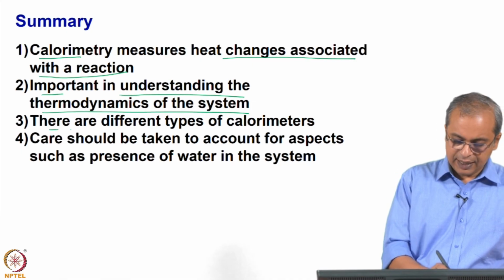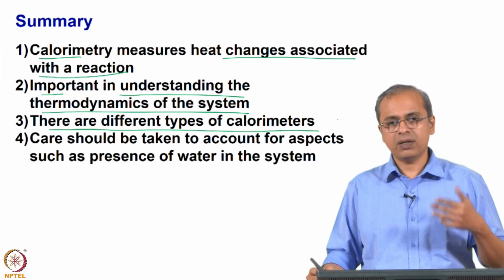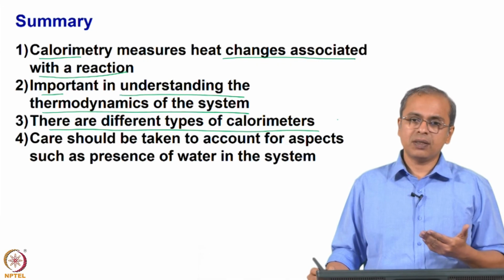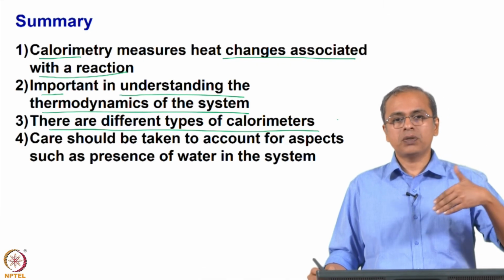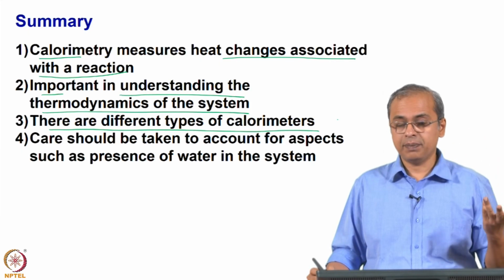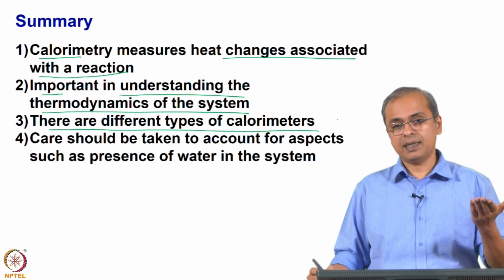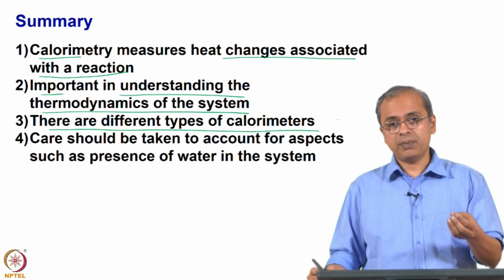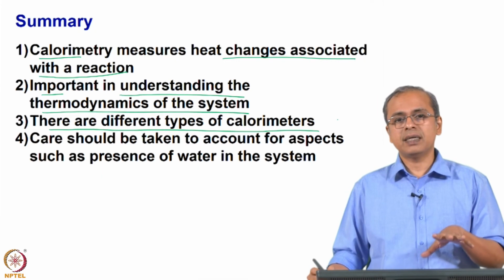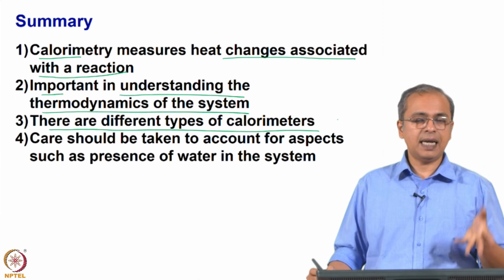I also indicated that there are different types of calorimeters, not simply in terms of the quality of the build or the precision or the level of insulation and so on. We also have some variations based on whether you want to measure Cp or Cv, or whether you are trying to do a measurement which is closer to room temperature, relatively speaking, or you are looking at measurements which are at much higher temperatures. So, for example, the drop calorimeter and the drop solution calorimeter that I discussed would be the kinds of calorimeters you would work with if your research area is in the area of ceramic materials.